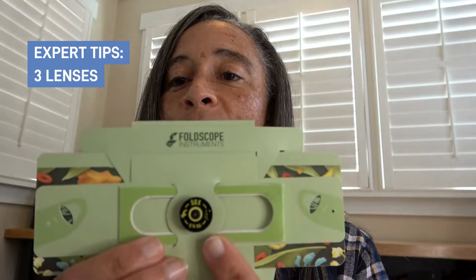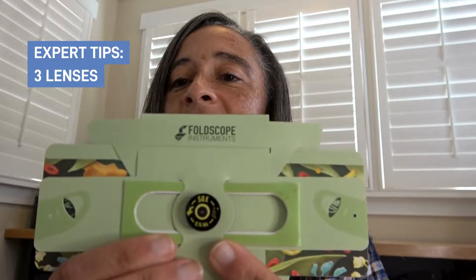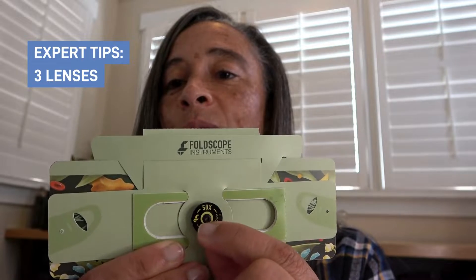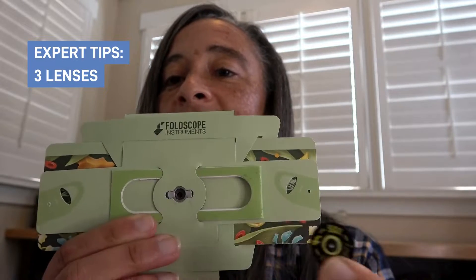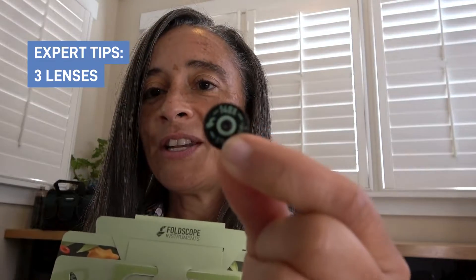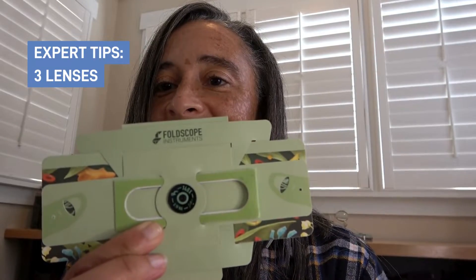The lenses are interchangeable and they hook to the front of the Foldscope with a magnet. As you can see here, I have my 50x lens attached. If I want to do some viewing at 140x, all I have to do is remove it from the front of the Foldscope. I take my 140x lens and pop it right on.